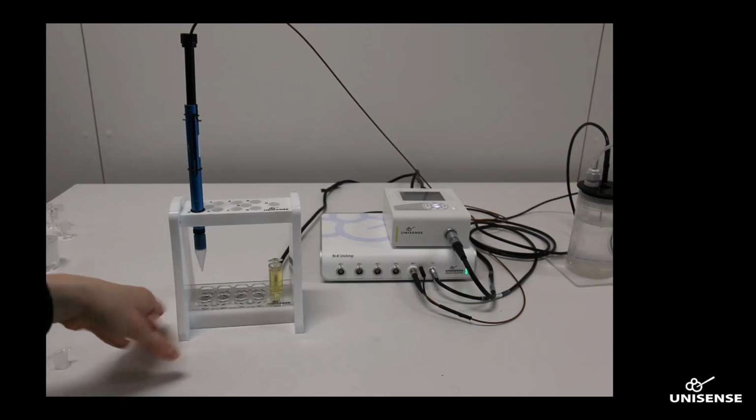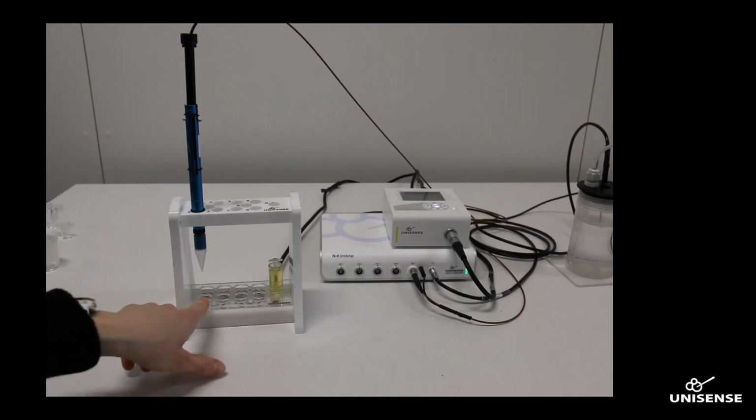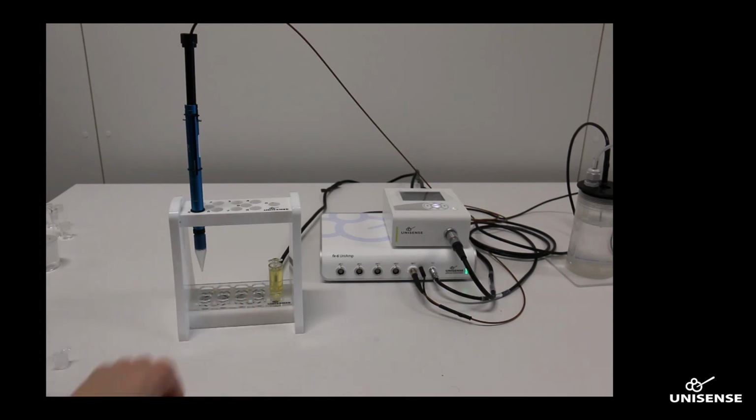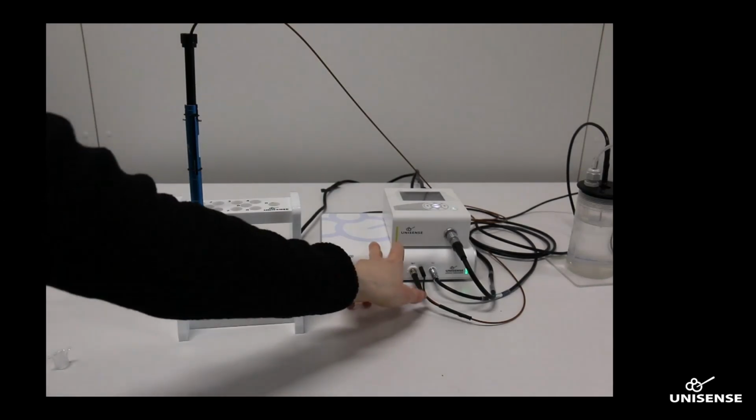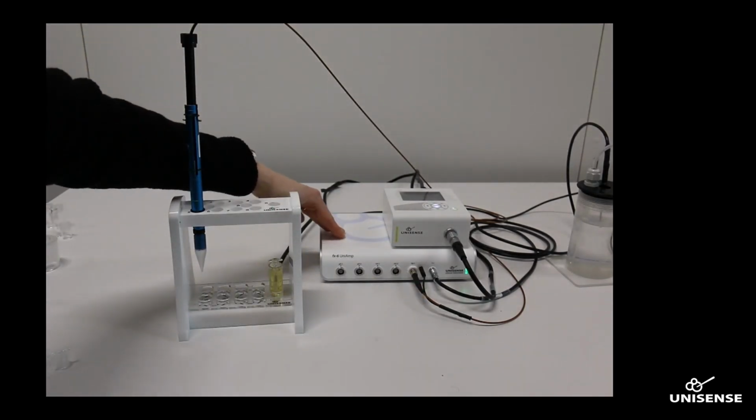Yeah, so here you have the rack. It holds the microsensor and it also holds the chambers, and it can hold up to 8 of the small glass chambers. If you're working with the larger chambers, it can hold 2 of them. The sensors are connected to the Unisense amplifier, and you can use all the different Unisense amplifiers with these microsensors.